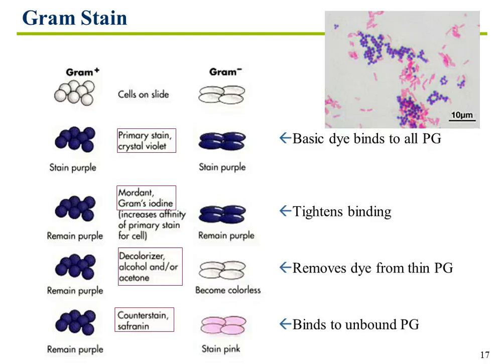You've got coccus-shaped clusters of blue cells. Those are your gram-positive that retain the purple dye, crystal violet. And then you've got some small rods, which are actually 2-3 times as big as the cocci in length, but they are rod or bacillus shaped. And they are pink, and they decolorize and pick up the safranin, which is a pink dye.